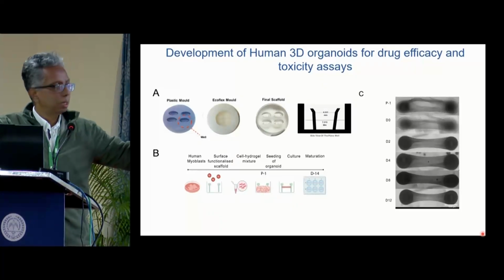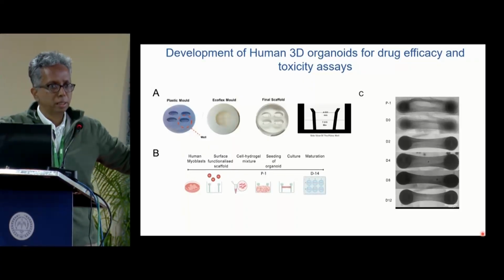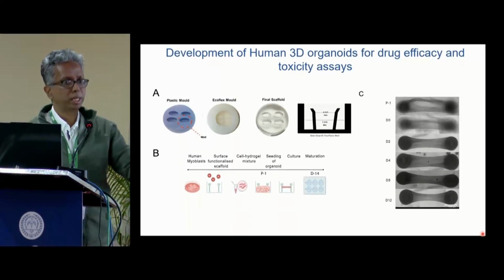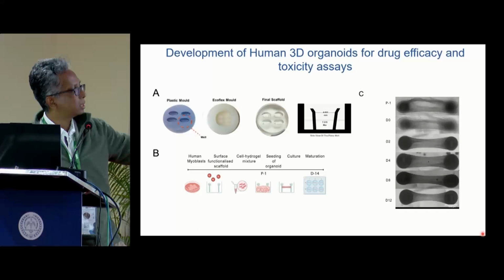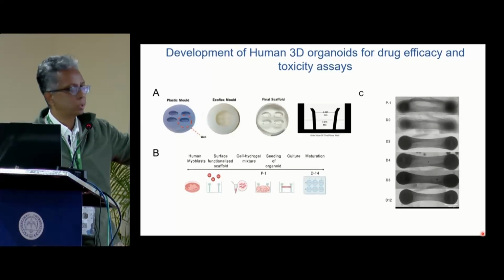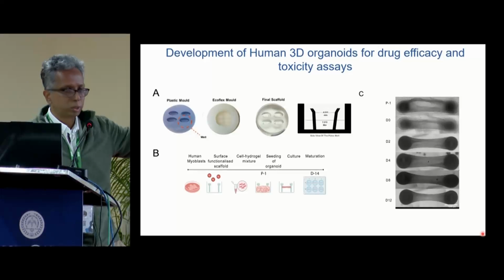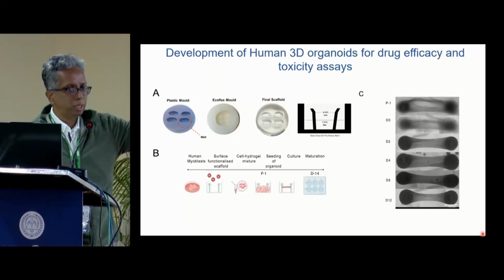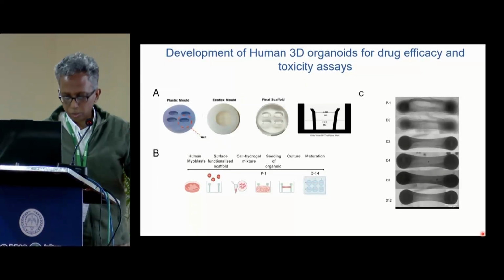Around them, a muscle is formed, and over time it organizes itself into 3D human myofibers, and I'll show you some histological evidence of what kind of muscles they are, and also some functional data that we're getting. In hydrogels with some Matrigel and growth factors, we put the myoblasts embedded in those hydrogels into the scaffolds, and over about 12 to 14 days, they self-organize into myofibers.